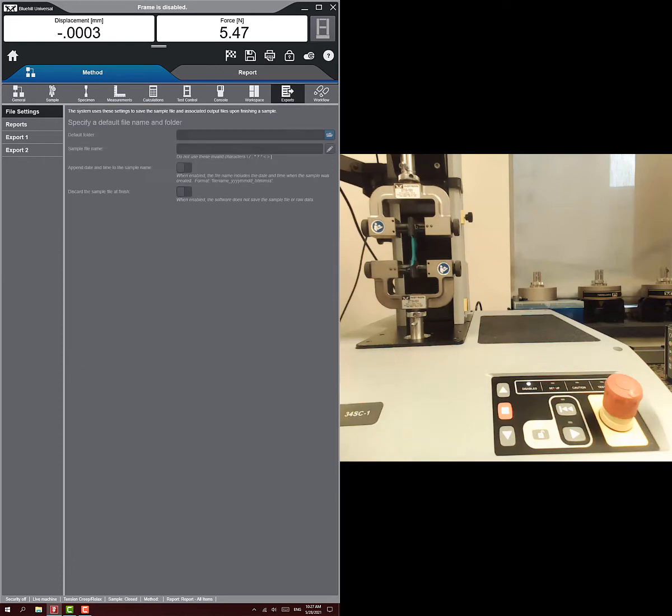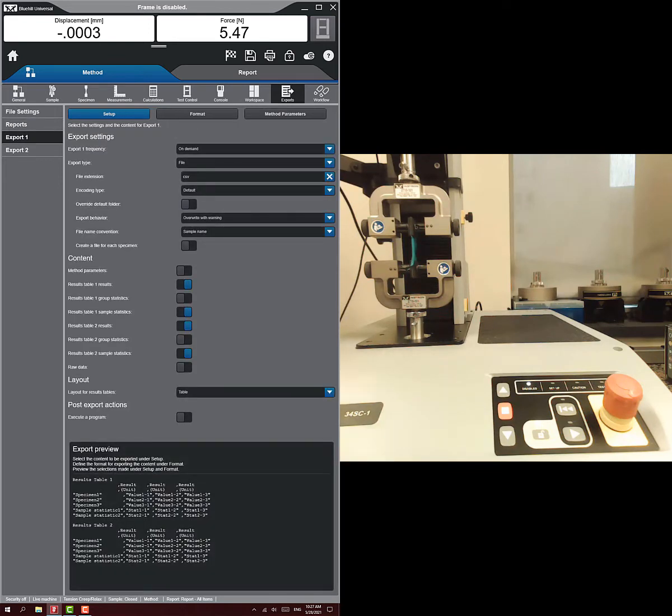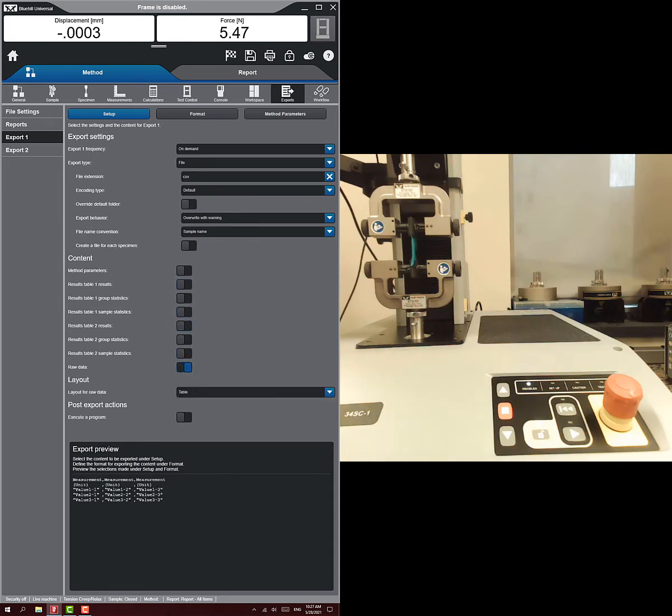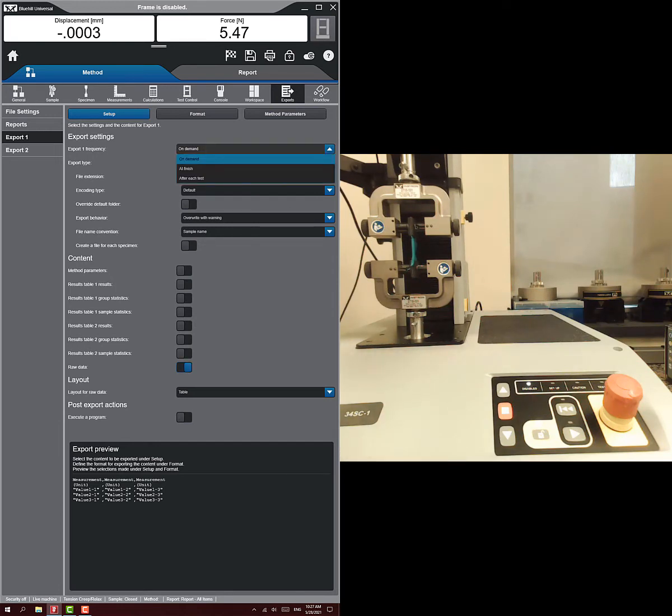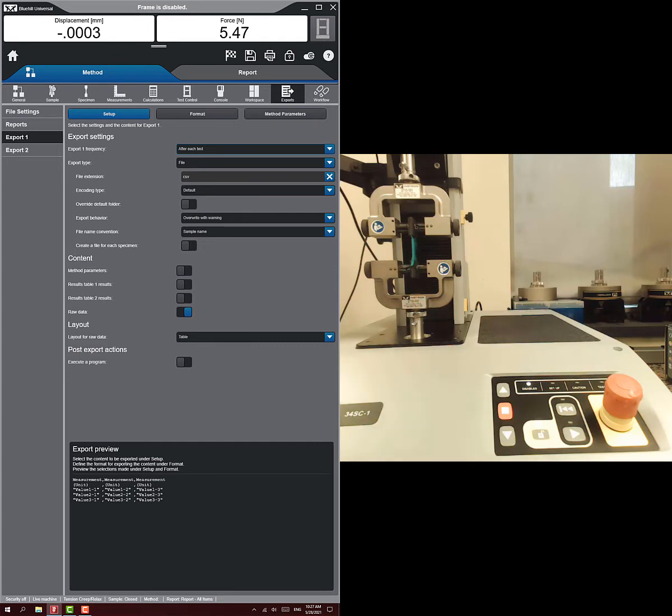And then exports. We just want to make sure - I turn off the report all the time, but we want to make sure we're exporting raw data. That's all I really want is the raw data. None of this other stuff I care about. I don't want to do it on demand. Like on demand is you ask it to export, and so that means you could forget. So that's why I like to change it to after each test. It's going to be a CSV file.